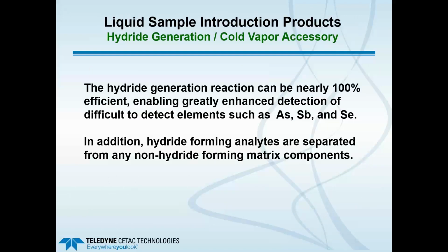So the hydride generation reaction can be nearly 100% efficient, and that enables greatly enhanced detection of more difficult to detect elements such as arsenic, antimony, and selenium. In addition, the hydride-forming analytes are separated from any non-hydride-forming matrix components. So those will simply be pumped out to waste and do not get to the ICP or ICP-MS plasma. So that can greatly simplify method development when you don't have to worry about interferences from common matrix components such as sodium and calcium.